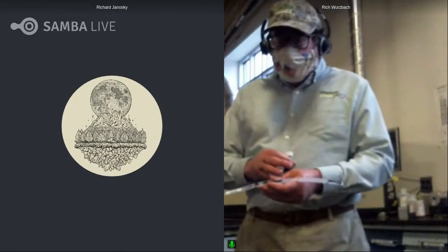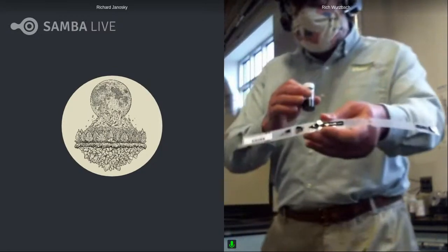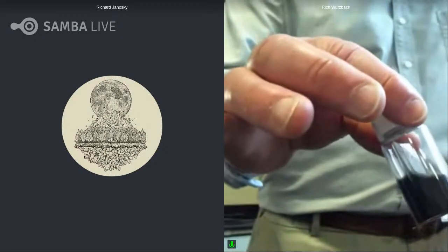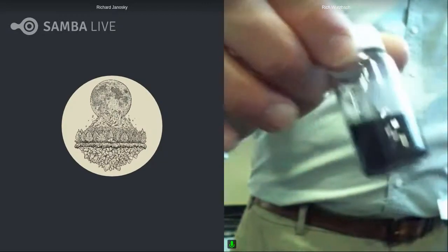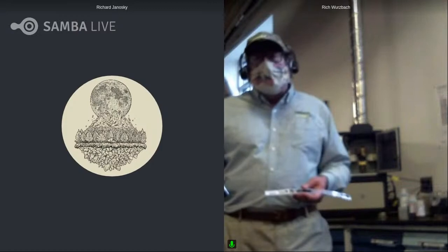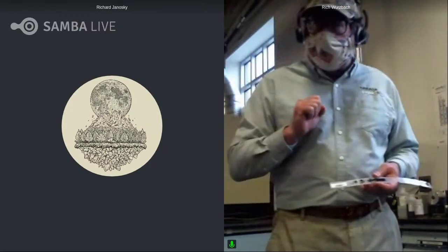Once we have this substrate, what's nice is we have a thin film of grease. It makes a big difference when you go to dissolve the grease whether you're starting with a glob or with this extruded thin film. With the extruded thin film in the container where you add your solvent, you have a large surface area and the ability to agitate very effectively. As you can see, we end up with a clean substrate when we're done, which tells us we've done a nice job dissolving the grease and getting the particles suspended and the grease dispersed. From this starting point, we're now going to pivot to Spectro's equipment and show how you're going to run this kind of sample.